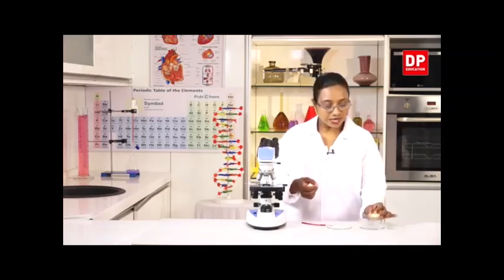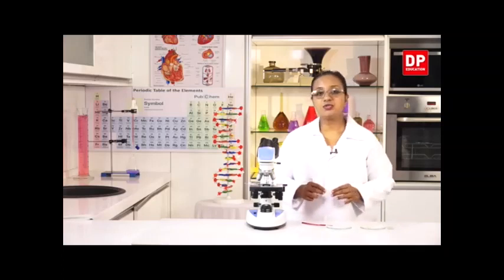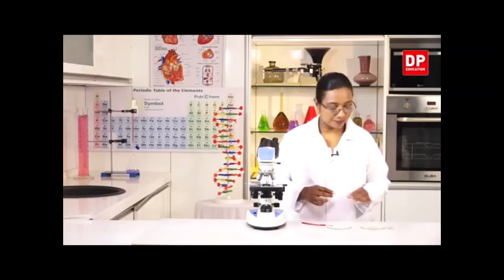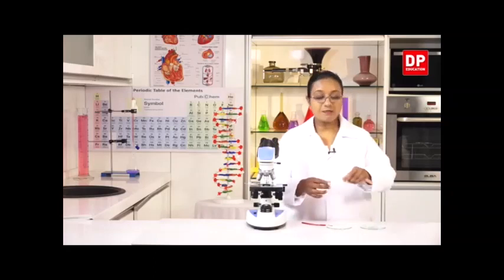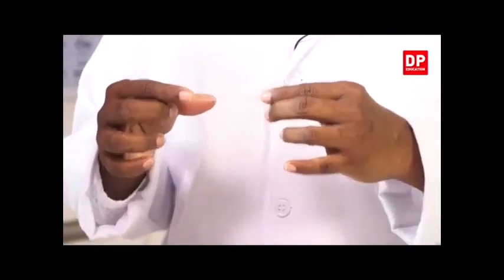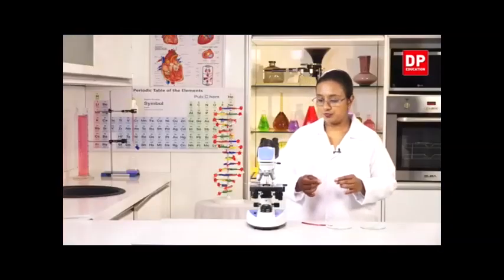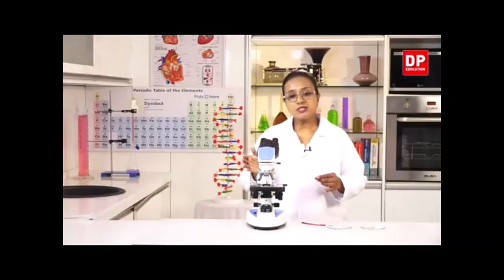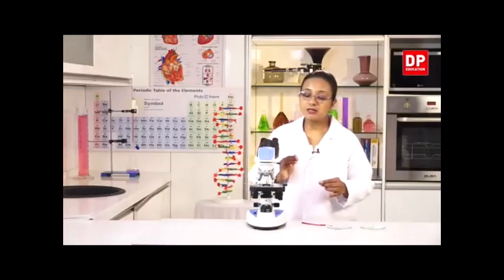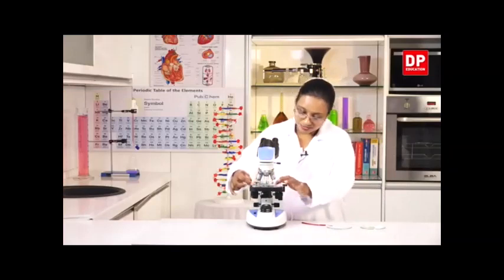I have already prepared this slide using a student's cheek cell sample. So I have a temporary slide mount of the cheek cell here. Now we will observe it under the light microscope. So as you know, students, when we are using the light microscope, we have to place the sample on the stage.